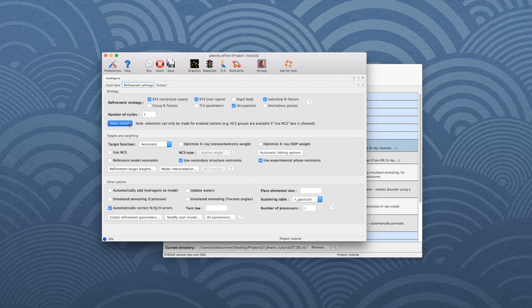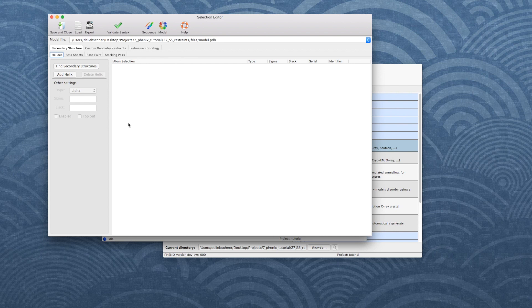Then click on Select Atoms in the Strategy field. A new window opens. The leftmost tab is for the secondary structure, which will not be present if the restraints checkbox was not activated. There are four sub-tabs called Helices, Beta Sheets, Base Pairs, and Stacking Pairs.